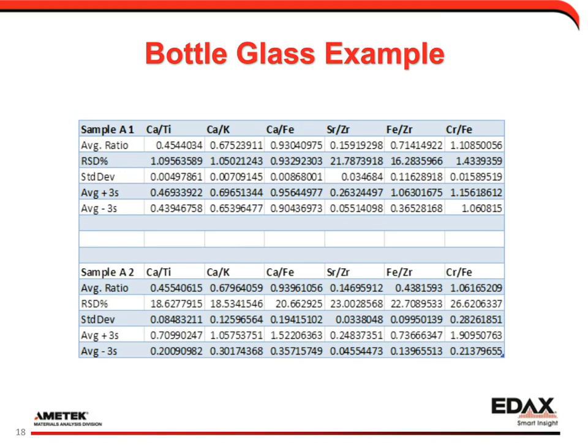So in this case, chrome and iron was used, but all the other ratios were taken from the method. They were then ratioed from all the 6 points to get one average ratio for each, and then their standard deviations were calculated, and the average plus 3 standard deviations and the average minus 3 standard deviations were created.